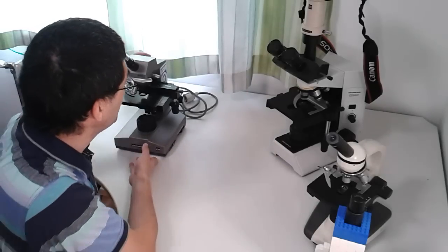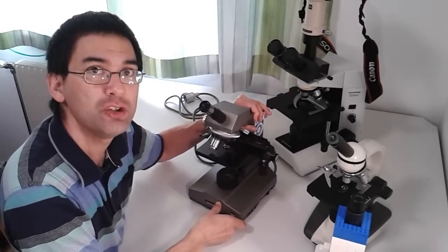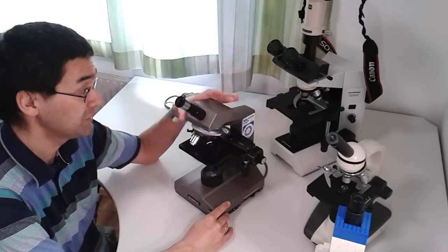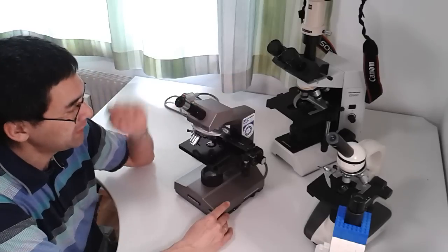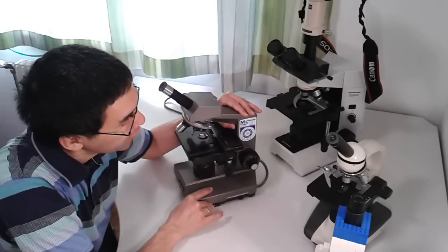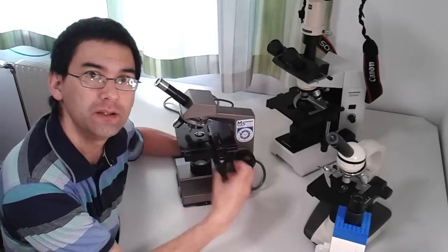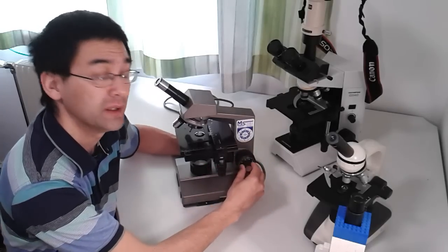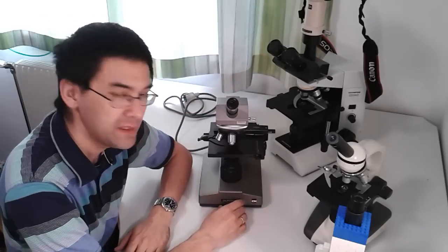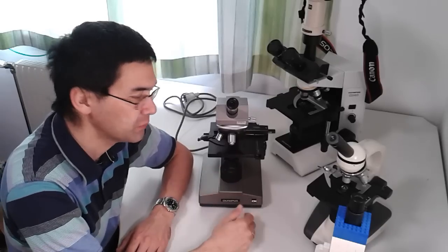The Olympus CH40 was sold as a so-called doctor's microscope. This one here is also no longer manufactured — it's the Olympus CH-A. If you ever have a chance to buy one used in good condition, it's excellent. I got this microscope a couple of months ago, but it was not usable because the lubrication oil in the focusing knobs and the mechanical stage had solidified. I contacted a microscope service company and they gave it a complete service and cleaning.